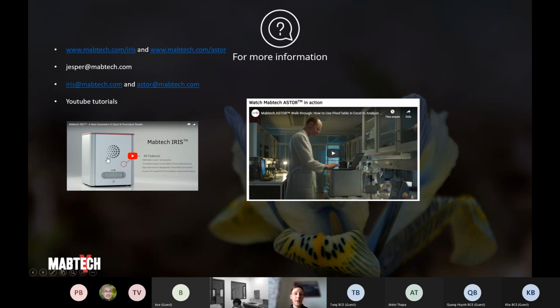This video was made on the Mac platform, and today we're working on the PC platform. But in many cases the functions are located in the same place, so it's not bad to have a look at that. And on Monday you're going to get the training from me, and that is also going to be recorded, so you can go back to that recording and watch one of the software features that we are explaining.